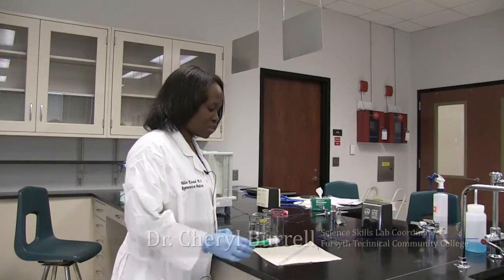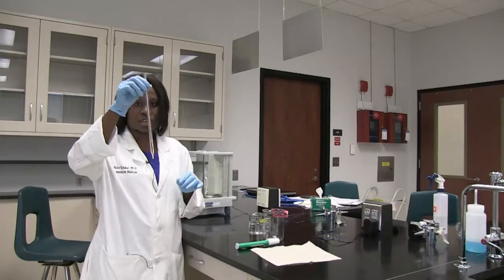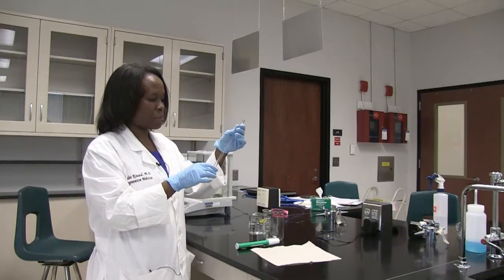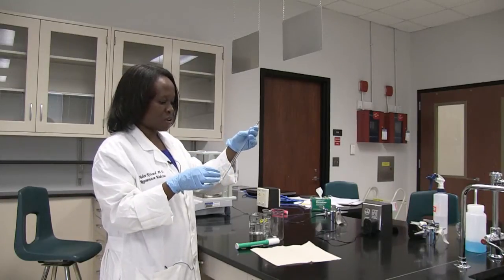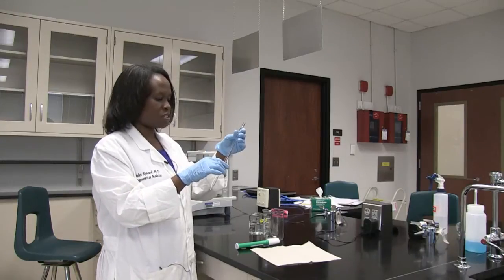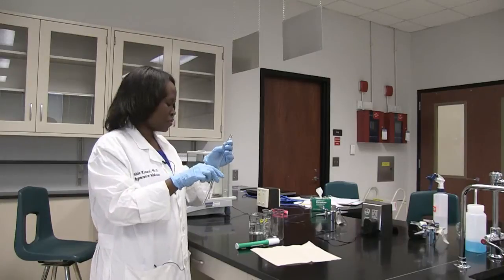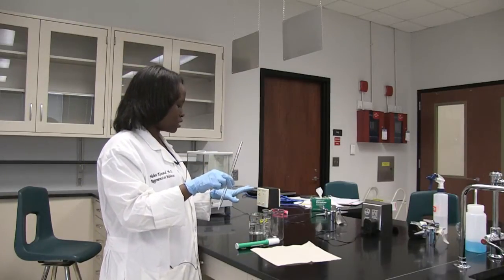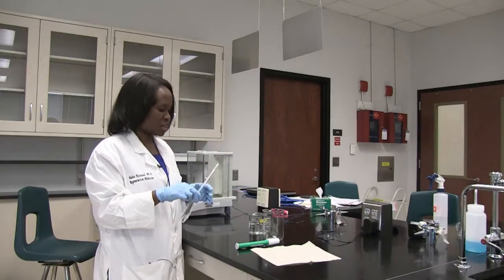One of the instruments that you'll be using in the lab for measurements is a serological pipette. If you look at the serological pipette, it has increments starting from 1 right up to 10. So you can measure any volume up to 10 mils of solution or liquid, and you can use it to transfer a certain volume of liquid from one container to the next.